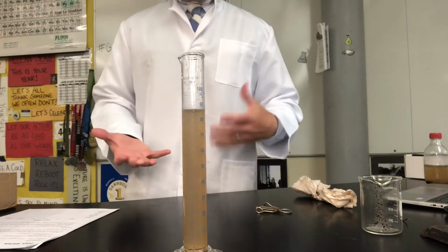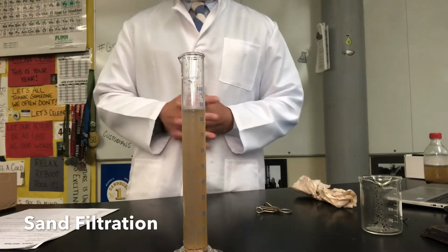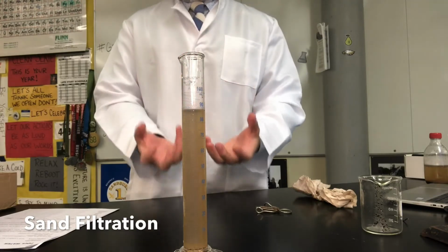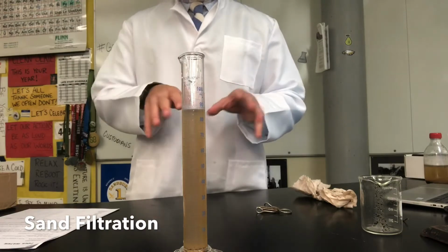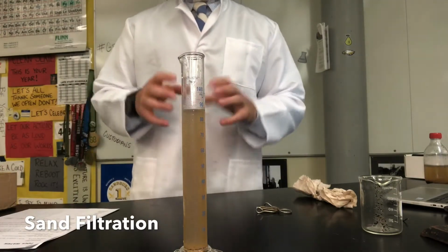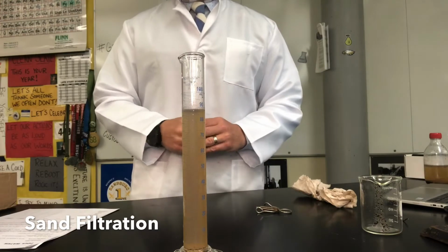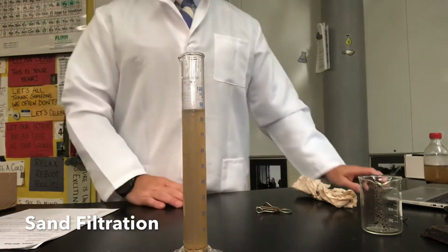We're gonna move on to something called sand filtration, which is another physical separation. We're gonna have sand and gravel, and we're going to pour the liquid through and gravity will pull the liquid down through the sand and gravel. All these little chunks and particles and maybe even some leftover oils are gonna stick to the sand and gravel, and hopefully more of the water will come out. So we'll set up that apparatus in just a second, and we'll let that go and see how that helps our physical separation lab.